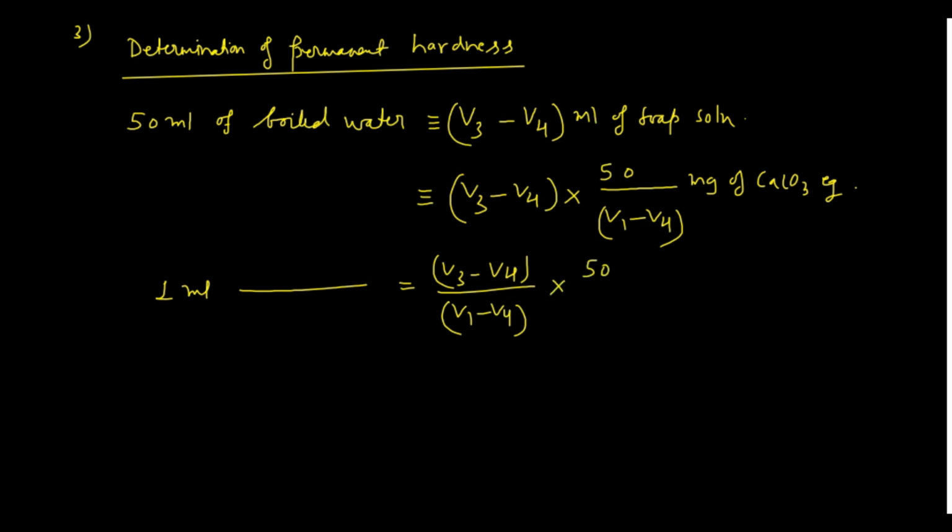I'm doing this for 50 ml, so this 50 is here. This is mg of CaCO3, and I'll do this for 1000 ml or for 1 liter.